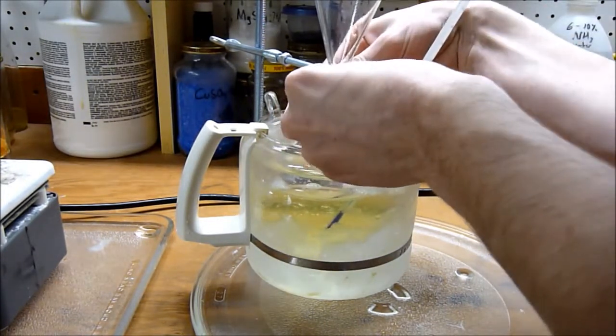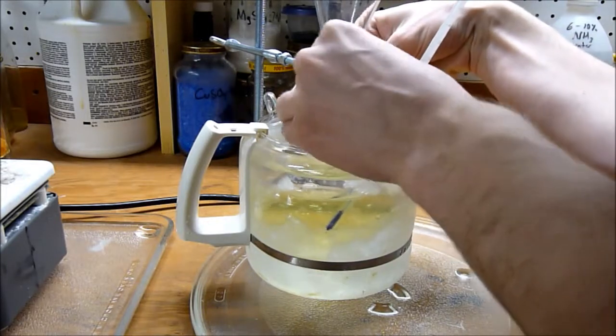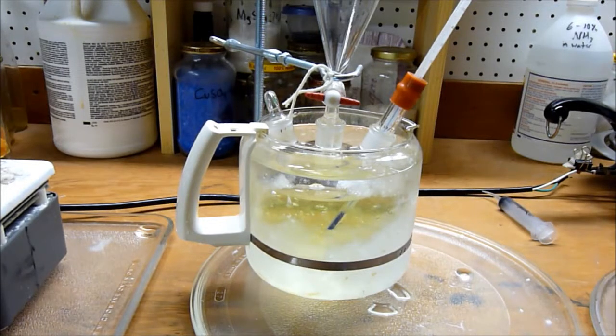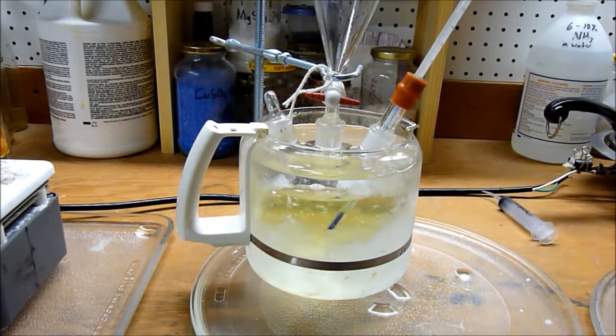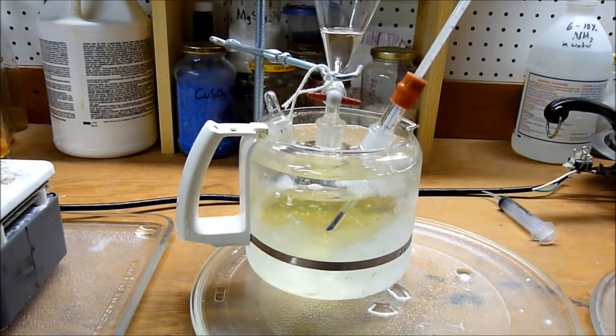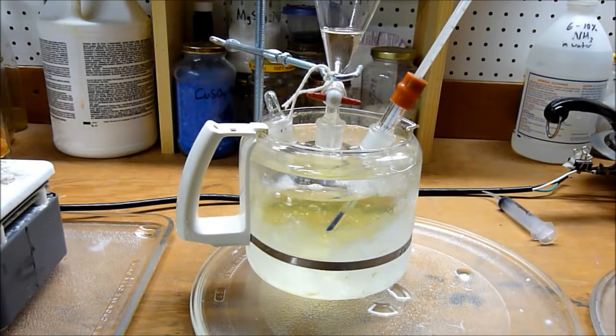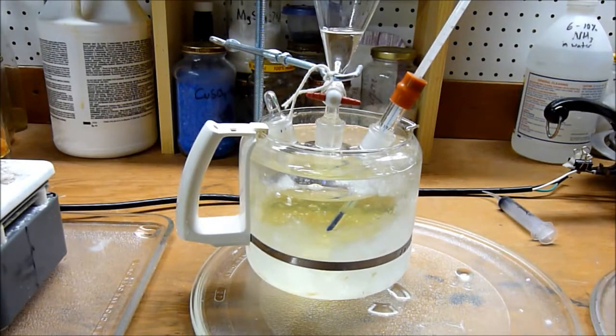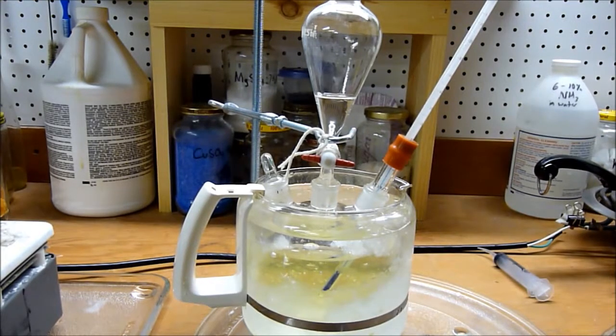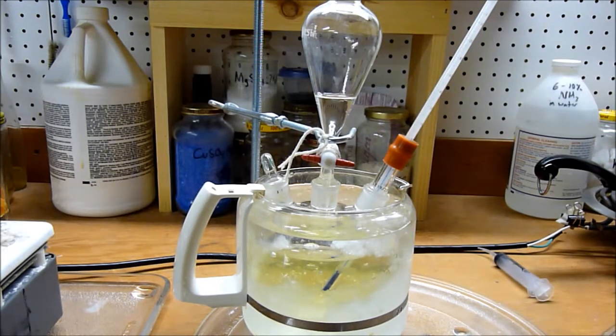Make sure the stopcock is in fact off, because otherwise that would lead to quite a disaster. Here goes the acetone. Now we have the acetone in the addition funnel right over the sodium hypochlorite solution. We will now begin slowly adding the acetone in small increments while monitoring the temperature to make sure nothing gets out of hand.